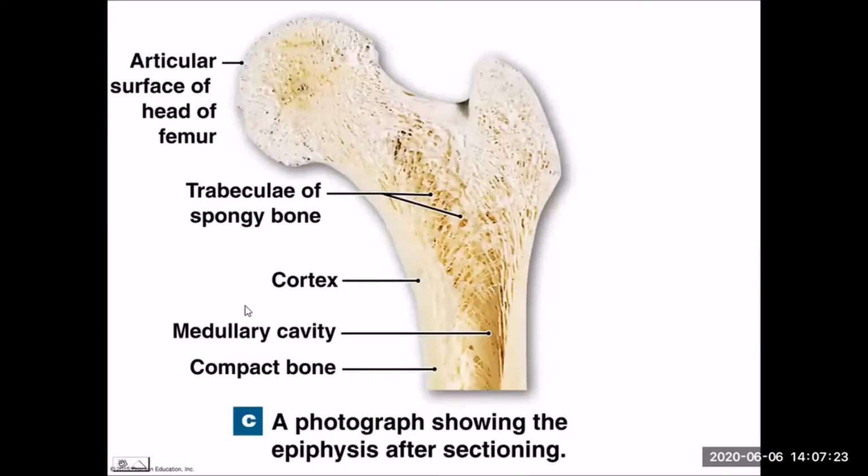And just a closer detailed image of that. So we're looking here at the epiphysis with the, of course, spongy bone, and then moving out more closer to the superficial edge is where we see more of that compact bone. And here we're seeing the proximal end of the medullary cavity.